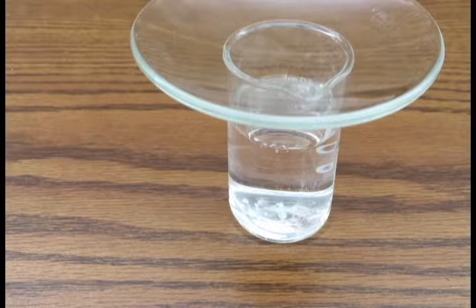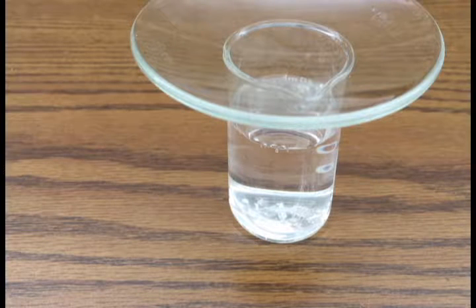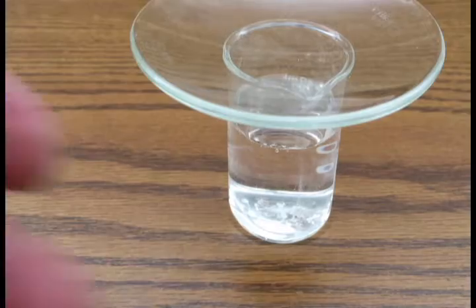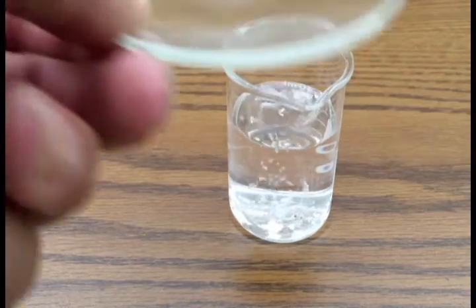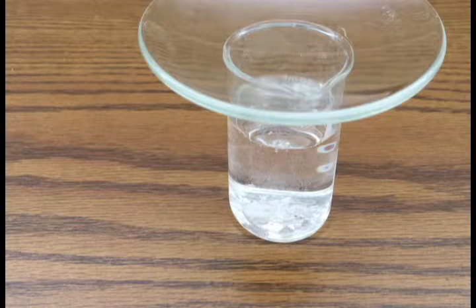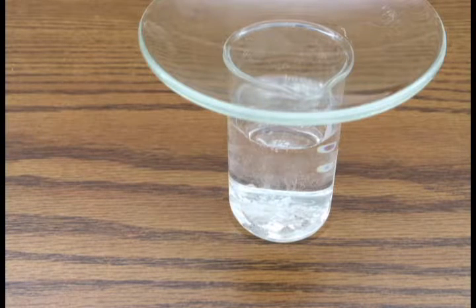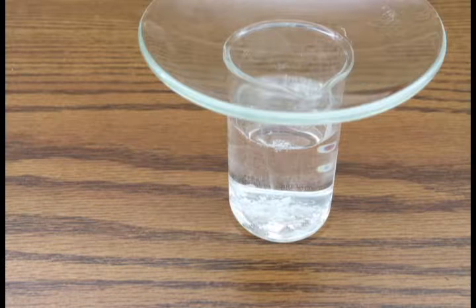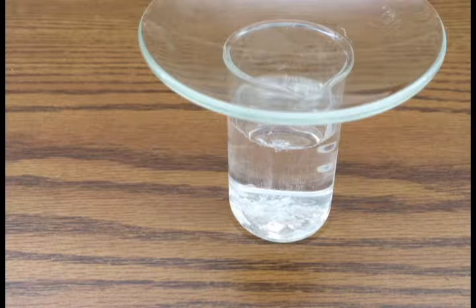I have some calcium metal in water. You can see that the calcium metal is bubbling. I'm going to add some more calcium metal to the water, and you can see that the calcium metal is fizzing like Alka-Seltzer.